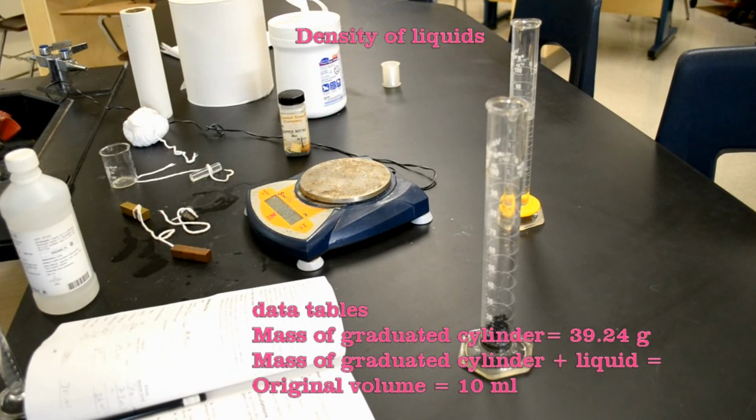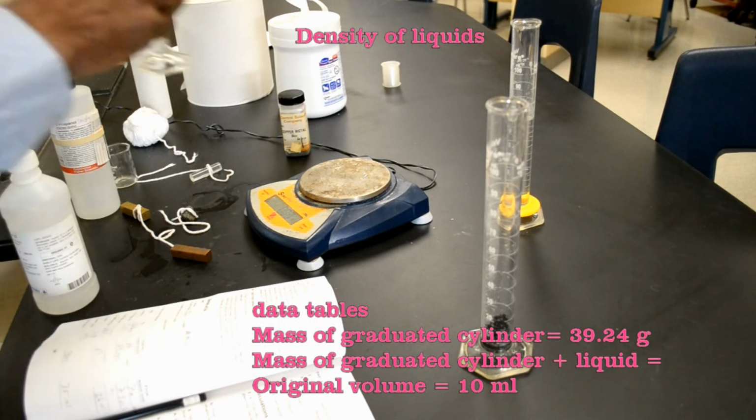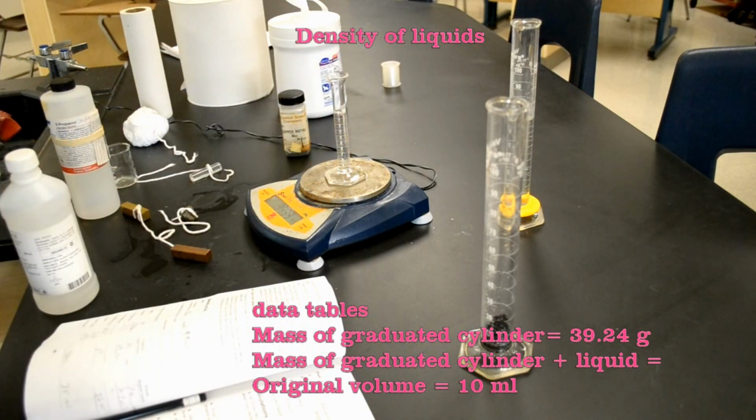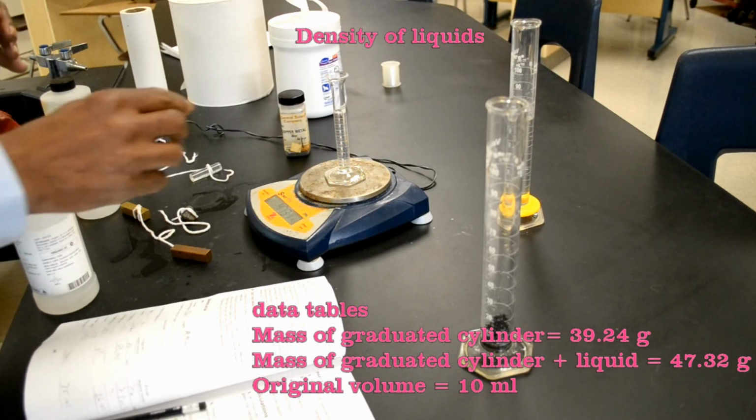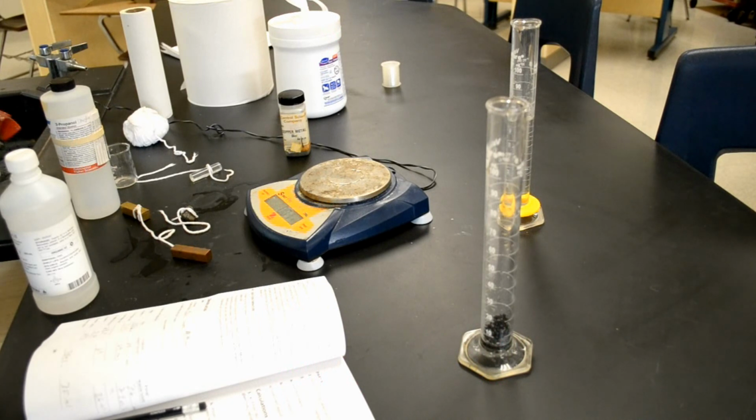The reason I'm telling you this is because in the end we have to calculate the densities of these liquids. If our calculation is correct, the densities should match up. 10 mLs, and it comes out to 47.32. Okay, so now the only thing left to do is the calculations.